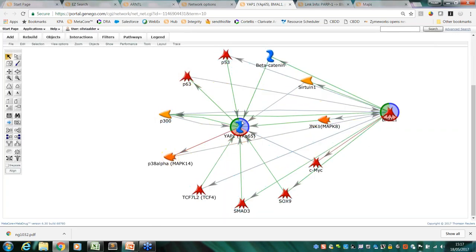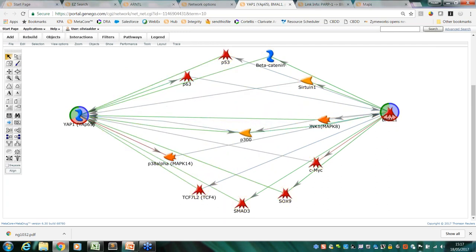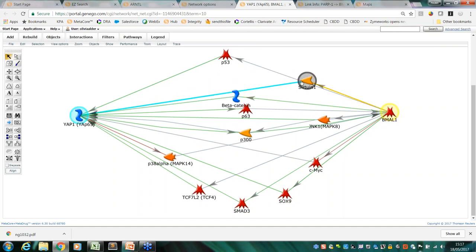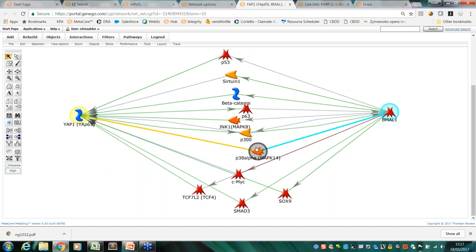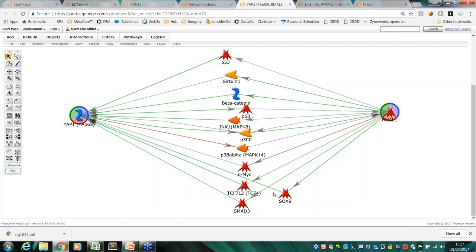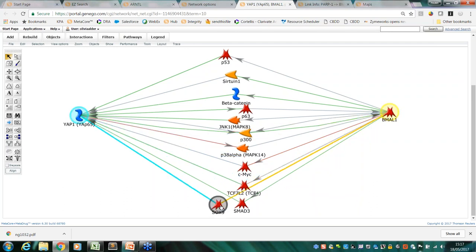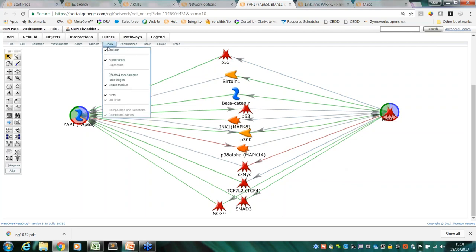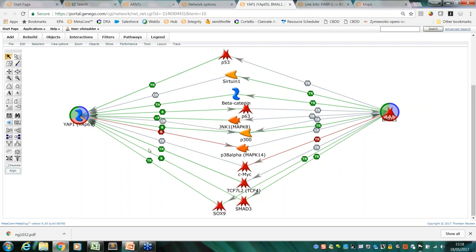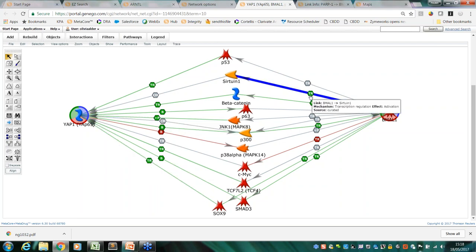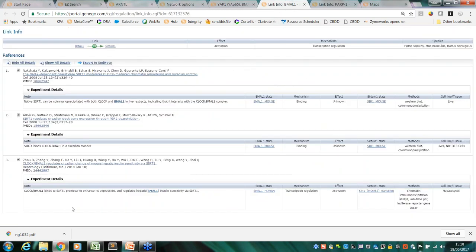These are the genes that I started with, BMAL1 and YAP1, and then these are all the ones that connect them. Although these genes weren't directly connected, only by adding an extra step in, there are a number of methods in which signaling pathways or signals could pass between these two genes. We can ask this to show us the mechanisms by which these interactions take place, like binding, phosphorylation, or transcriptional regulation. You can always link back to the literature that those interactions were based on.